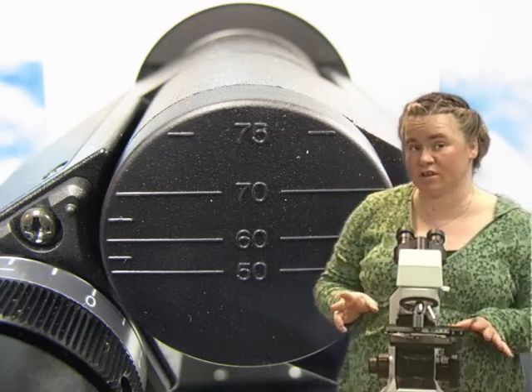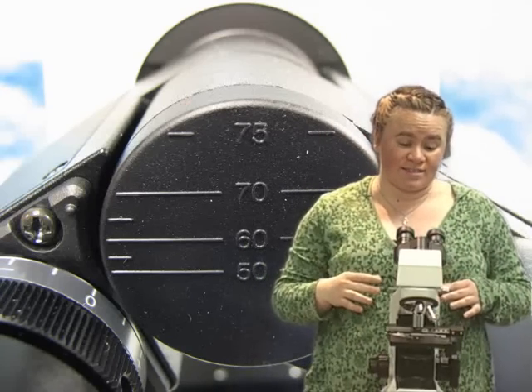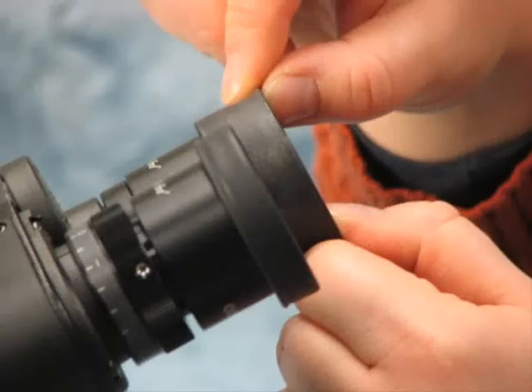The last thing we're going to look at on these scopes is specific for people who wear eyeglasses. If you don't wear eyeglasses, you wouldn't make this adjustment. If you do, you want to make it so that you can be closer to the microscope and the image that you're trying to see.